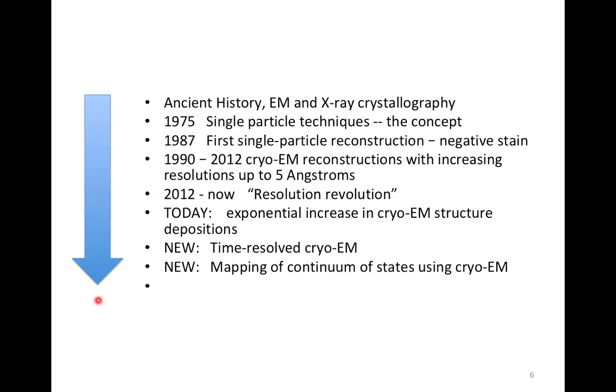From 2012, which is a milestone event, to now, we have a resolution revolution, which we still experience. Today, there's an exponential increase in cryo-EM structure depositions. What is new are a number of opportunities, such as time-resolved cryo-EM and the mapping of a continuum of states using cryo-EM. I will only talk about this very shortly.